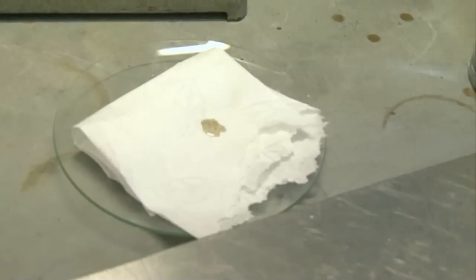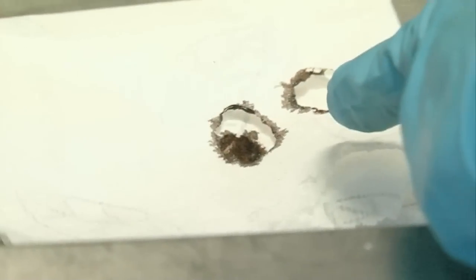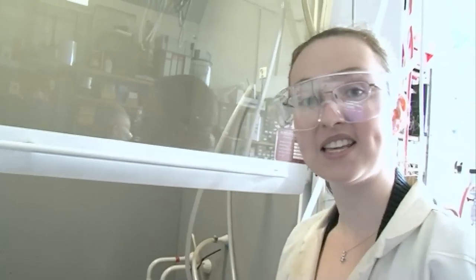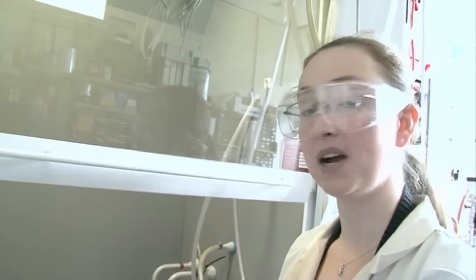It's actually munching through the paper, okay? So it's reacting with the kitchen paper. You can see it going. So it's pretty potent stuff. It's like burning almost. So we can take this to the next level, something you might have seen before.